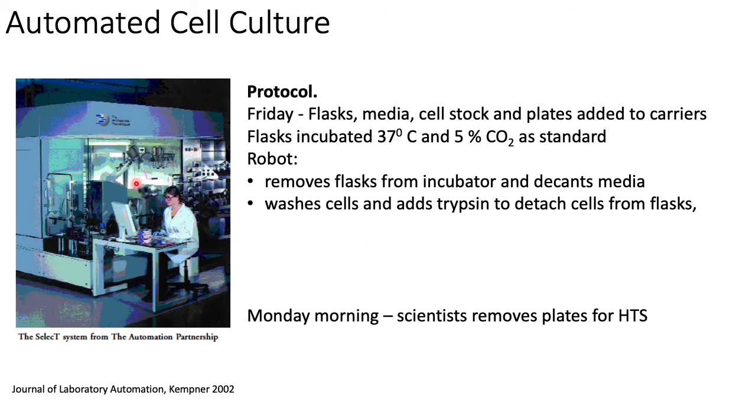The cells that we use will be stuck down on the bottom of the flask, so they attach, and then we need to wash the cells. We don't want to wash them off, but we just want to wash away any of those dead cells, and then afterwards we add the trypsin.